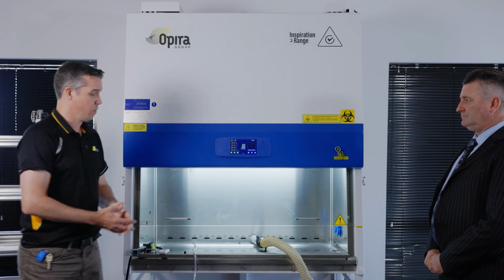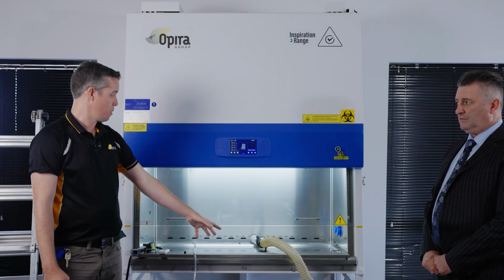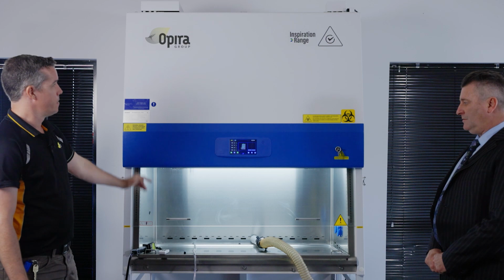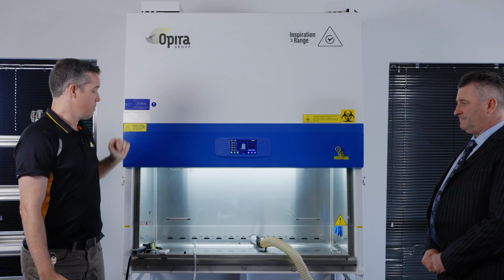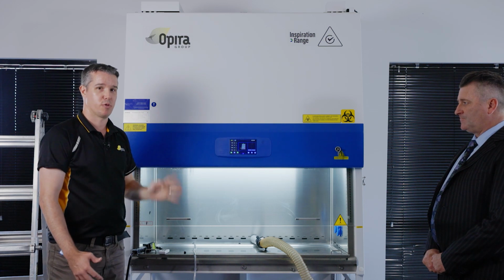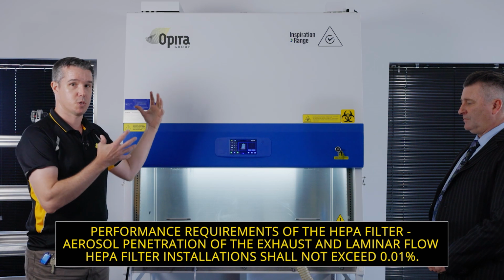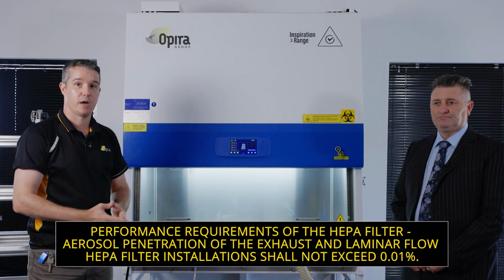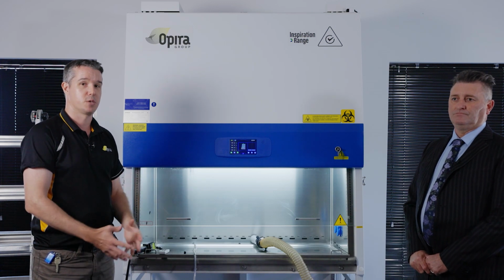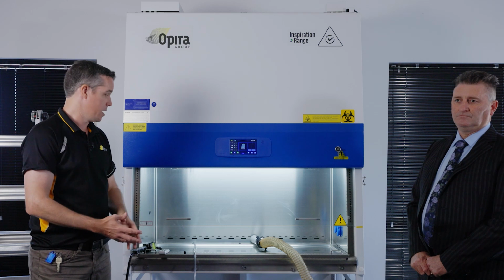The way that we test this according to Australian standard is creating an aerosol smoke that's released into the cabinet, challenges the air on side of the two filters, and then we scan how much of that aerosol is coming through. The pass-fail criteria is 0.01% of that aerosol concentration. And to work out what that is, as far as our photometer is going to read, we've got to calibrate each of our photometers to what the 100% reading is.